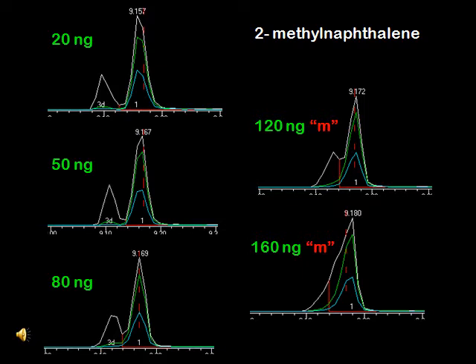The combined 160 nanogram analyte peaks were inappropriately manually integrated by subjectively dropping a perpendicular integration on the front slope of the combined peaks. The appropriate action by the person manually integrating the peak would have been to either drop the 160 nanogram standard from the curve or to rework the method to utilize another ion which would be less affected by coeluting peaks.